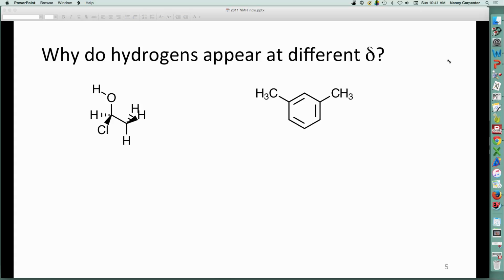Now, here's an aromatic ring. When you get out your correlation chart, for example, in Morrison or Cardi, either one's fine, you'll see that these hydrogens all show up really far to the left. The typical region for aromatic hydrogens is around 7 to 8 parts per million. So if you have signals around 7 to 8 parts per million, you know you have an aromatic ring.